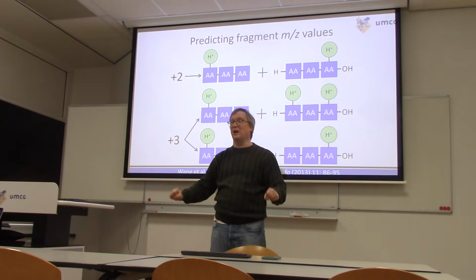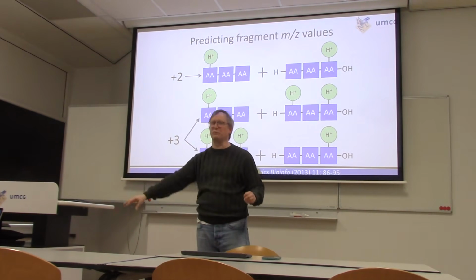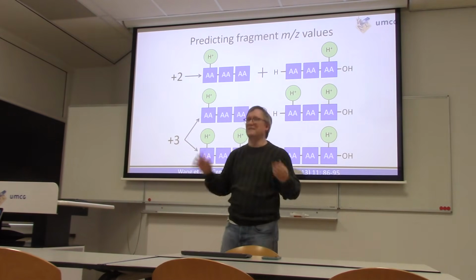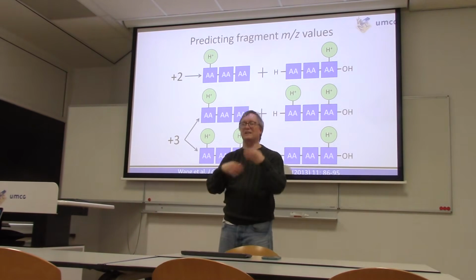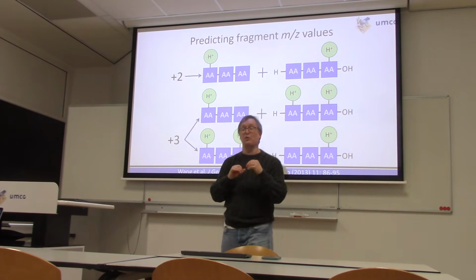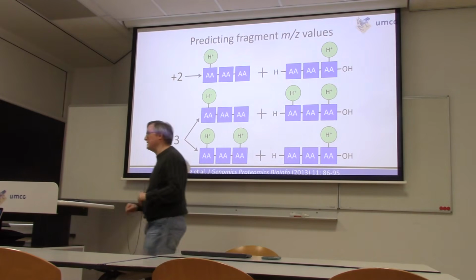You might say, oh, well then that's pretty easy. The larger fragment is going to get both protons. But in fact, it's quite a messy thing. We wrote a paper all these years back about trying to find determinants of when 2 protons go one way and 1 proton goes the other way. It's actually quite difficult to do.